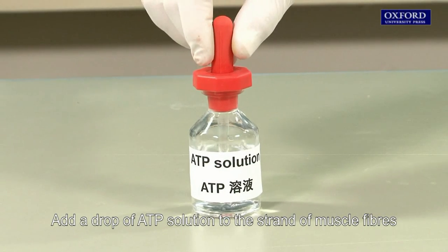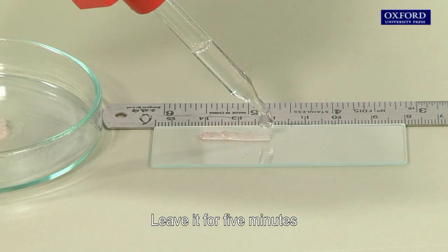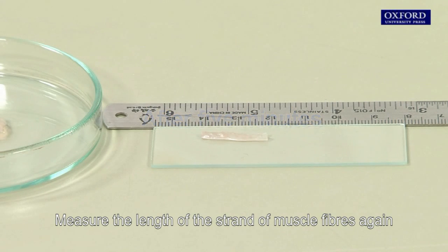Add a drop of ATP solution to the strand of muscle fibres and leave it for 5 minutes. Then measure the length of the strand of muscle fibres again.